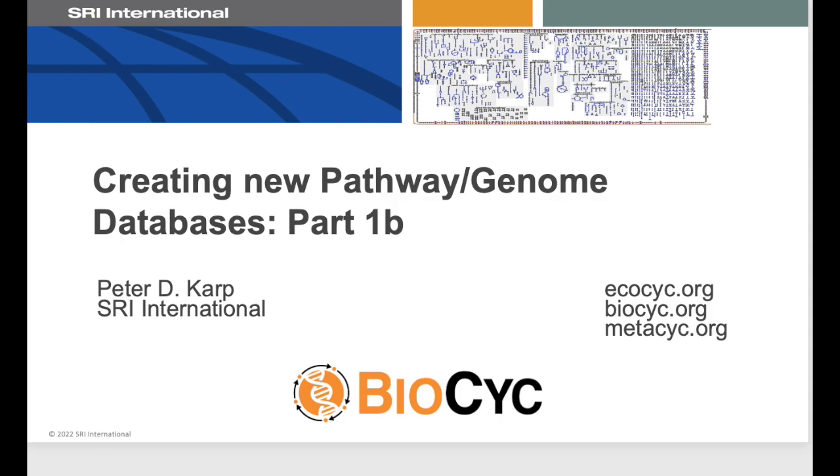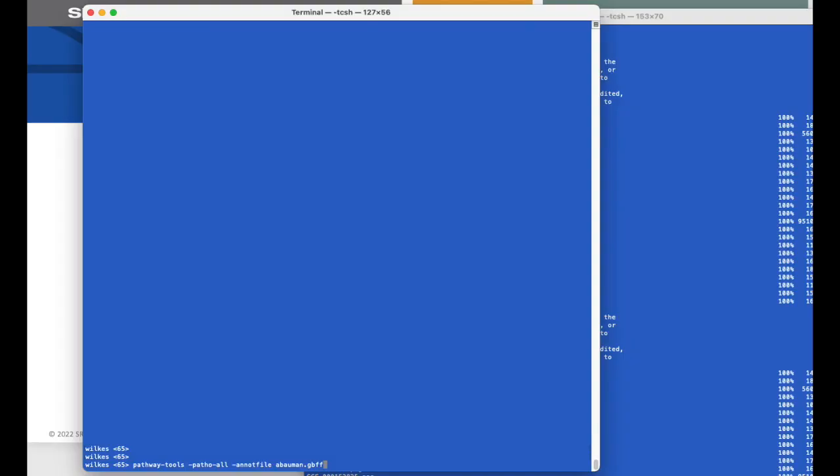In this video, we'll explore how to use the Pathologic inference component of Pathway Tools to create a new Pathway Genome Database. The simplest way to create a new Pathway Genome Database is by running Pathologic at the command line using a Unix command such as this one.